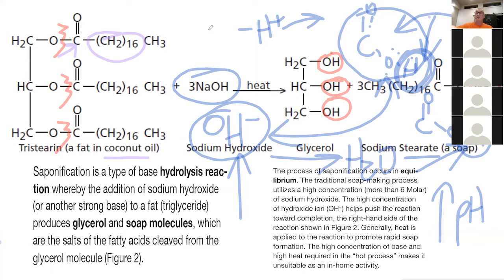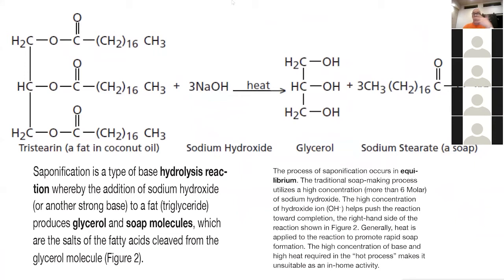And since we're going to get the conjugate base, it's going to have a negative charge, and it'll form an ionic interaction with sodium. And that'll be really important later, because one of the experiments you're going to do is compare what these soaps do in the presence of sodium versus the presence of divalent cations like calcium and magnesium. So we'll talk about that in a minute, because that will be the second part of the experiment that you're going to be doing yourself.